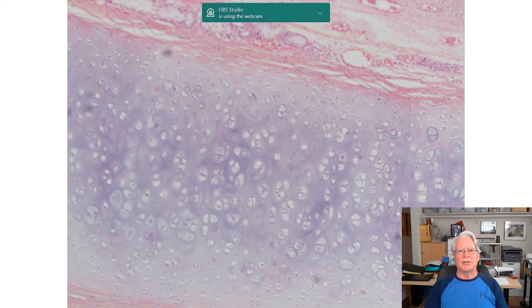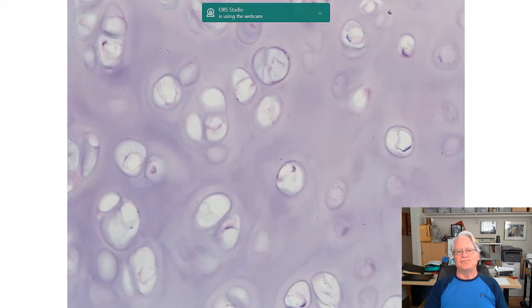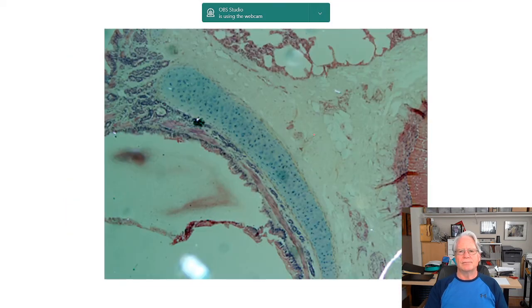Once again, cartilage. There's my connective tissue. All of this is the cartilage. Same pattern, holes, purplish hue. It's very distinctive. Again, there's the lacunae. There is my ground substance. Again, you cannot see the fibers, but they're present. Same thing, capsule, capsule, cartilage. Okay. Lung tissue up here. And again, this is the trachea.